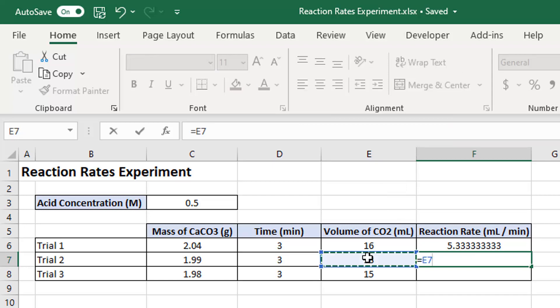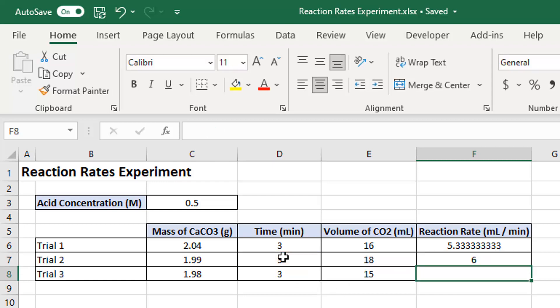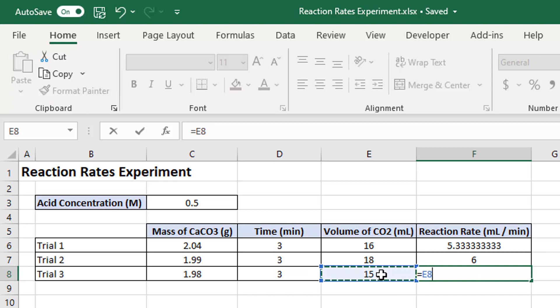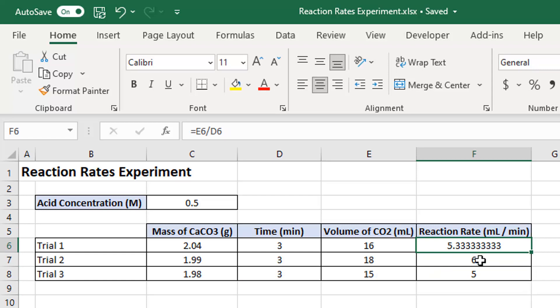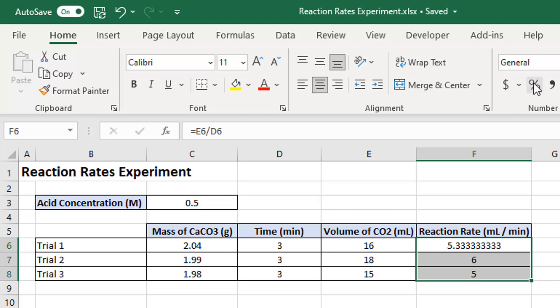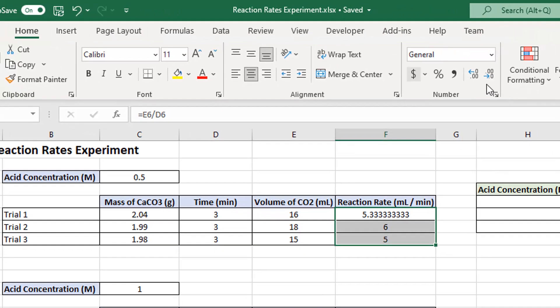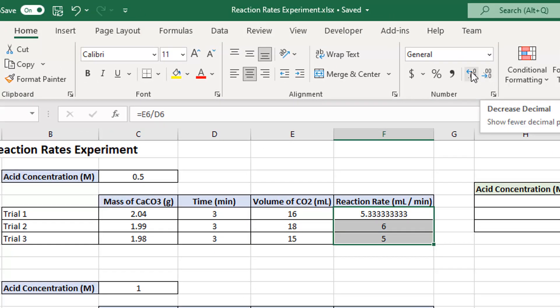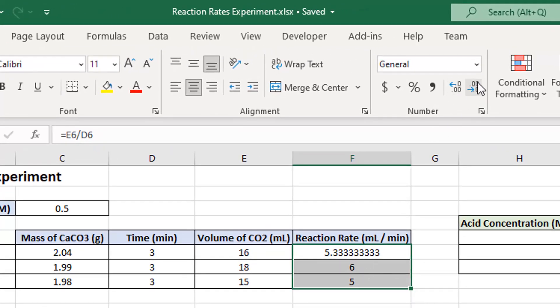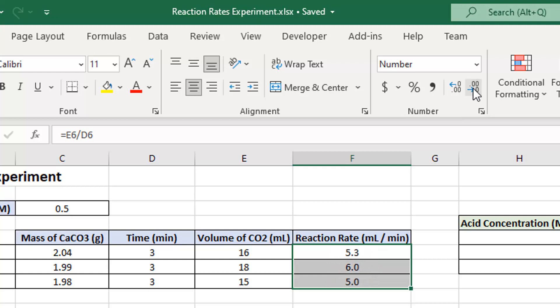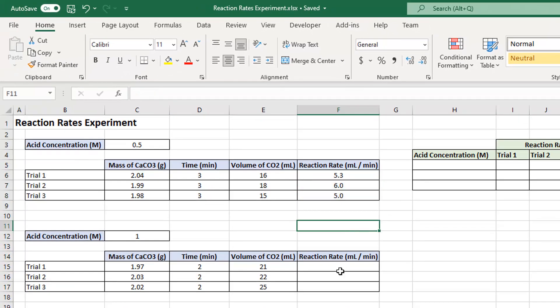I'll do the same thing again — equals, milliliters divided by minutes, Enter. Now there's a problem: one result shows 5.3333333, which looks messy. It's better to have the same number of decimal places. I'll select all three cells, go to the Home tab, and use the increase/decrease decimal places button. Given it wasn't a particularly precise experiment, let's set one decimal place.